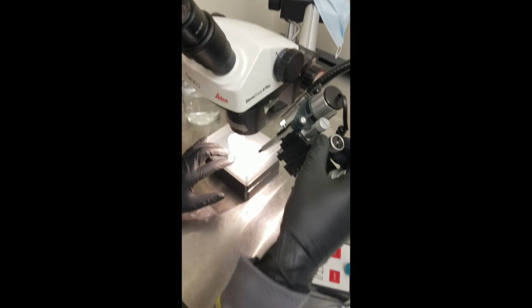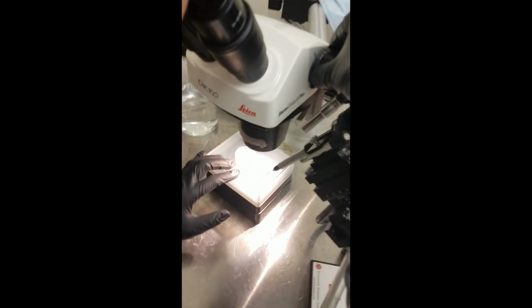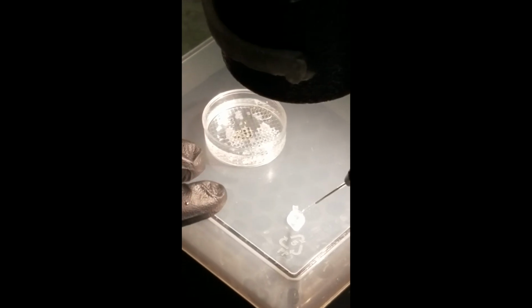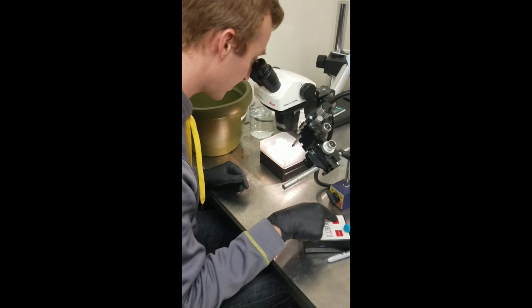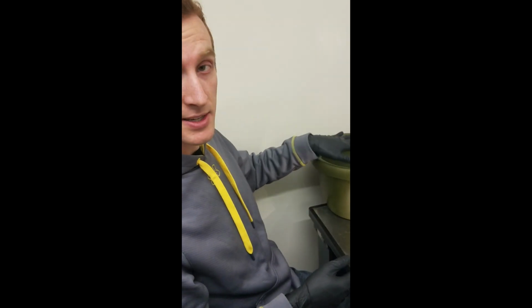Position it so that the tip of the needle just barely enters into the liquid. You have to be careful not to break the tip of your needle by going down too far and pushing it against the platform. And then once you're in the liquid, you go back to your control box right here and you push fill. And you have to watch it to make sure that the liquid doesn't jump around and that your needle stays in the RNA suspension. And you draw up all the RNA, and then once that's done, you take this and put it back in the freezer.